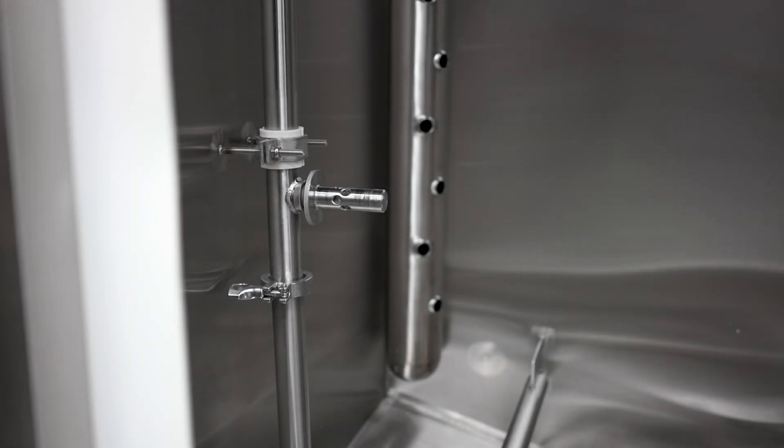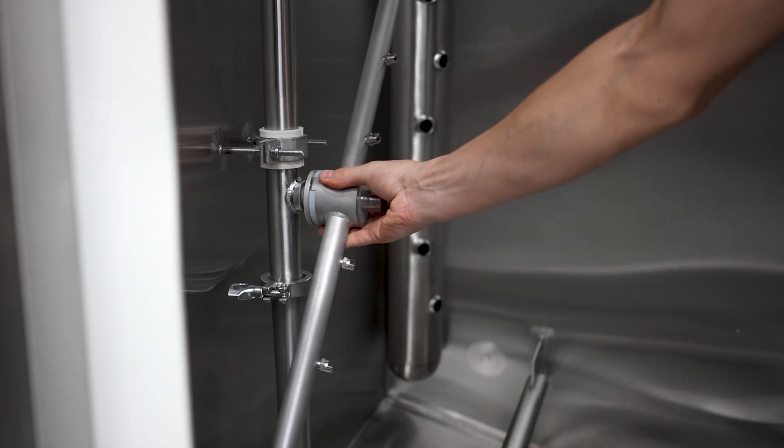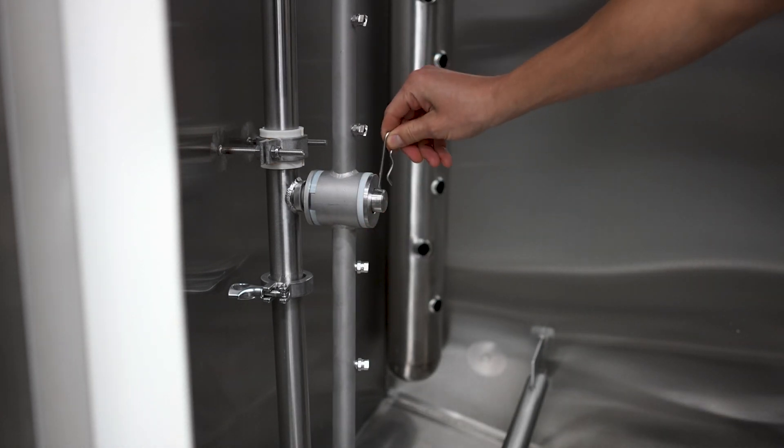To reassemble the rotary spray manifold, you just slide the bushing over, place the washers back on, and reinsert the hairpin clip.